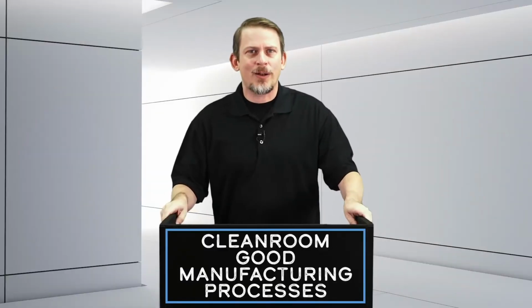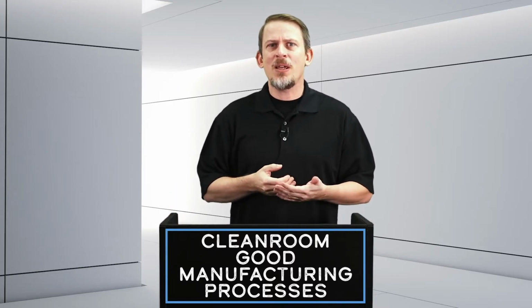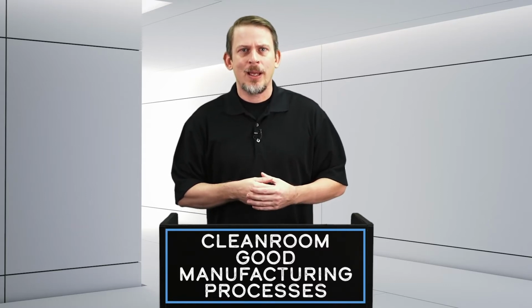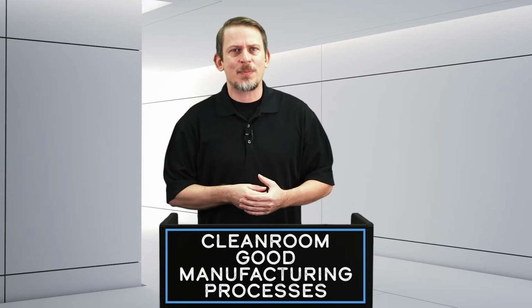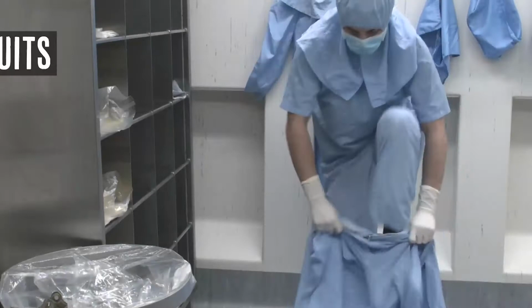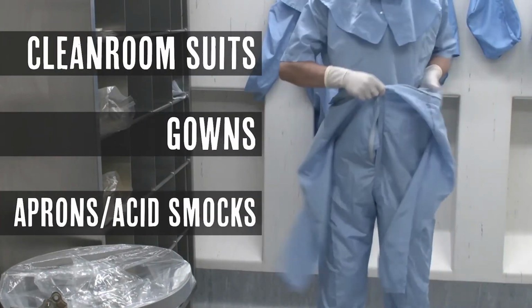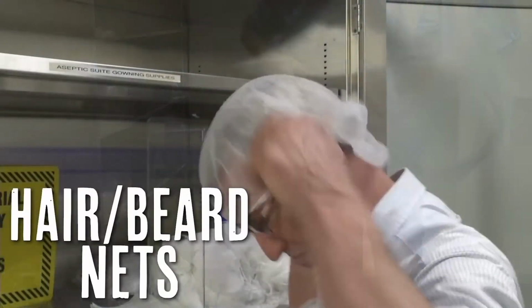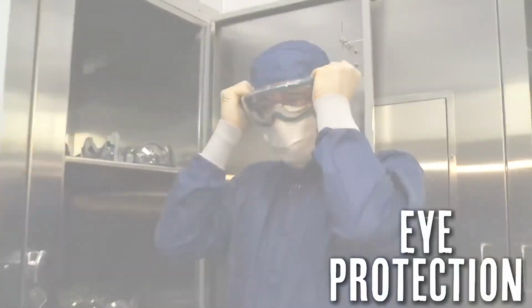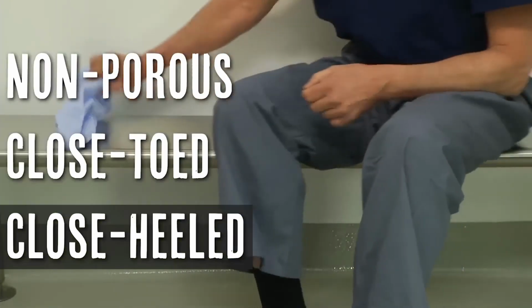If you're used to working around hazardous materials, wearing proper attire isn't a new concept. You should know that PPE is extremely important to the safety of those working around hazardous chemicals. Every employer may have different standards about specific equipment, but in general, the following should be worn: cleanroom suits, gowns, aprons or acid smocks, hair and beard nets, gloves, eye protection, and for your feet, make sure you wear non-porous, closed-toed, closed-heeled shoes.